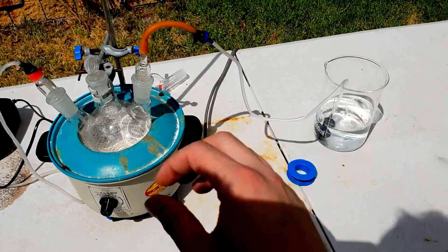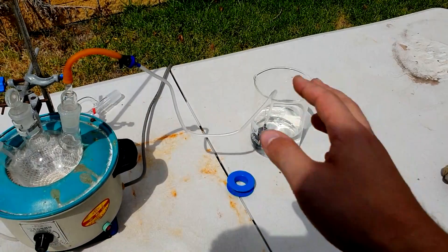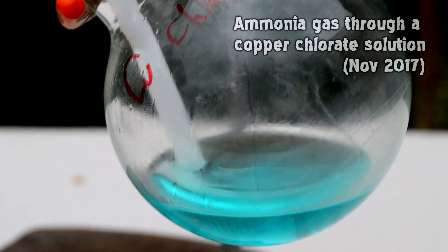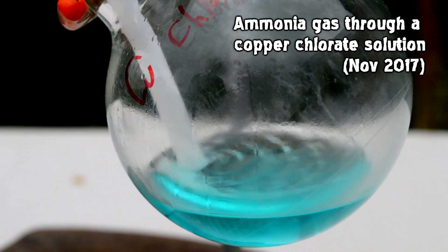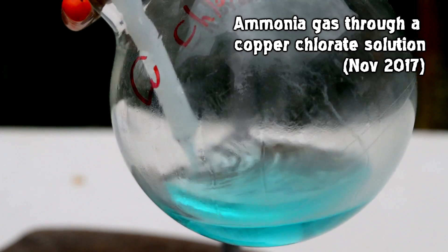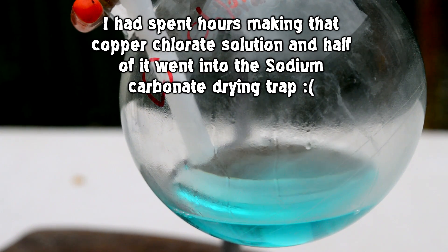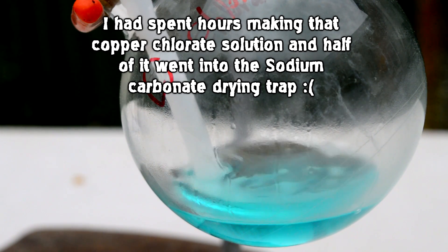But quite often it's just an experiment ruiner — all the ammonia solution you've been trying to deal with, or whatever you're bubbling ammonia through, just gets lost into a metal flask or whatever. No! Jesus Christ! No! All that time, all that work!